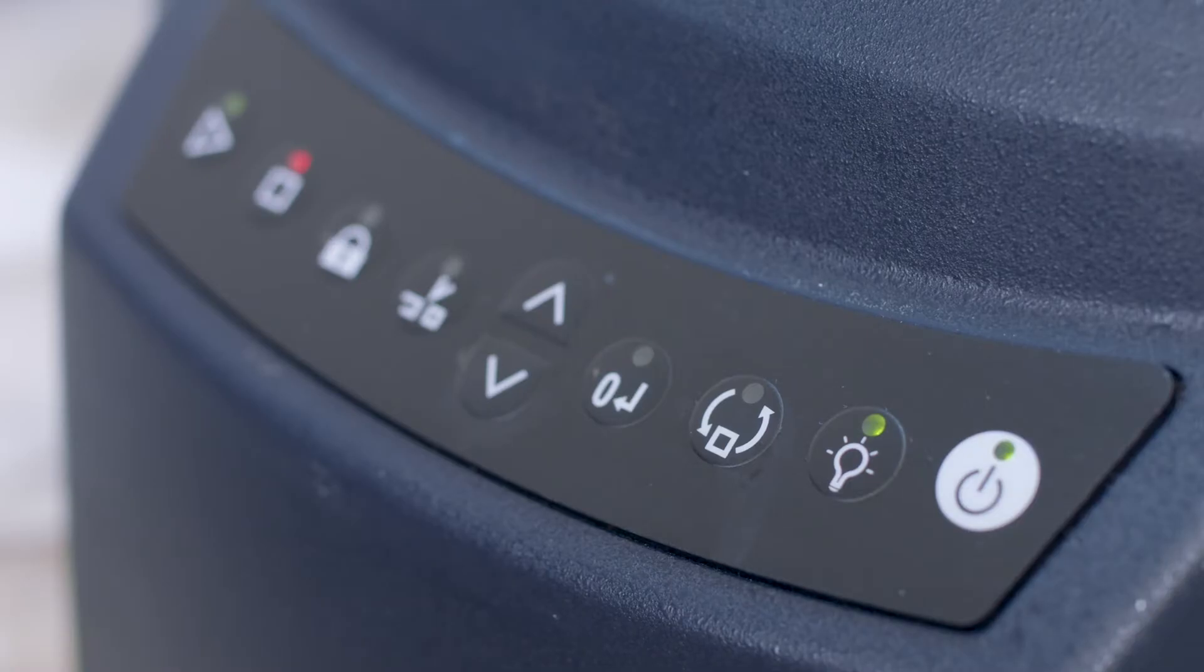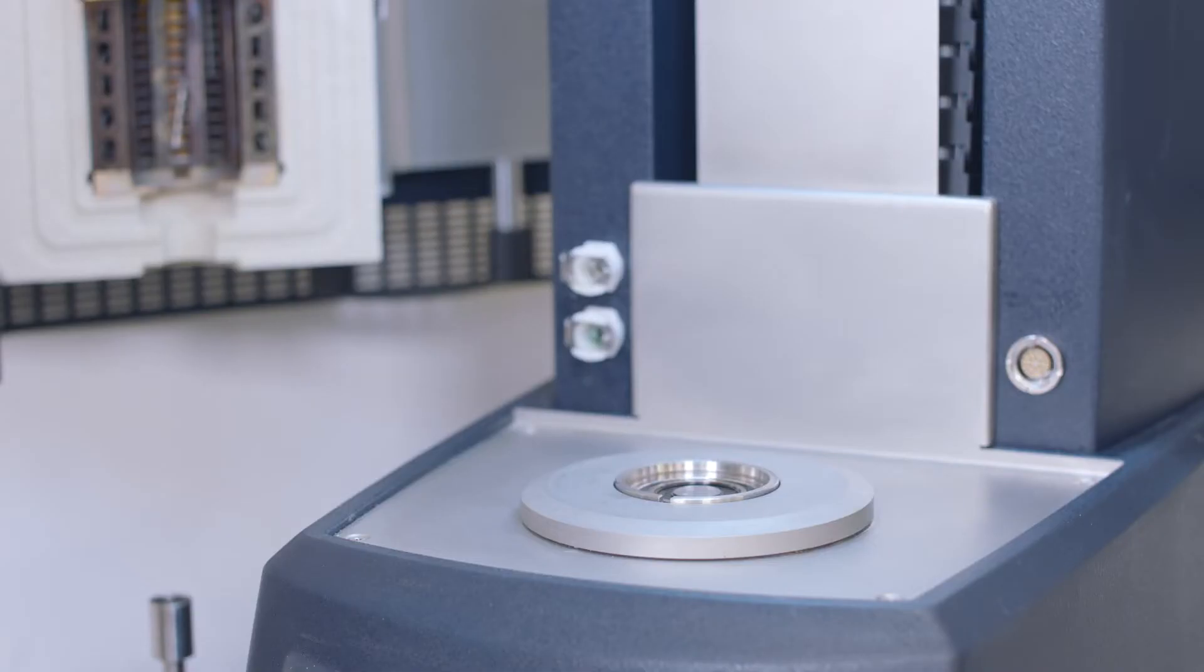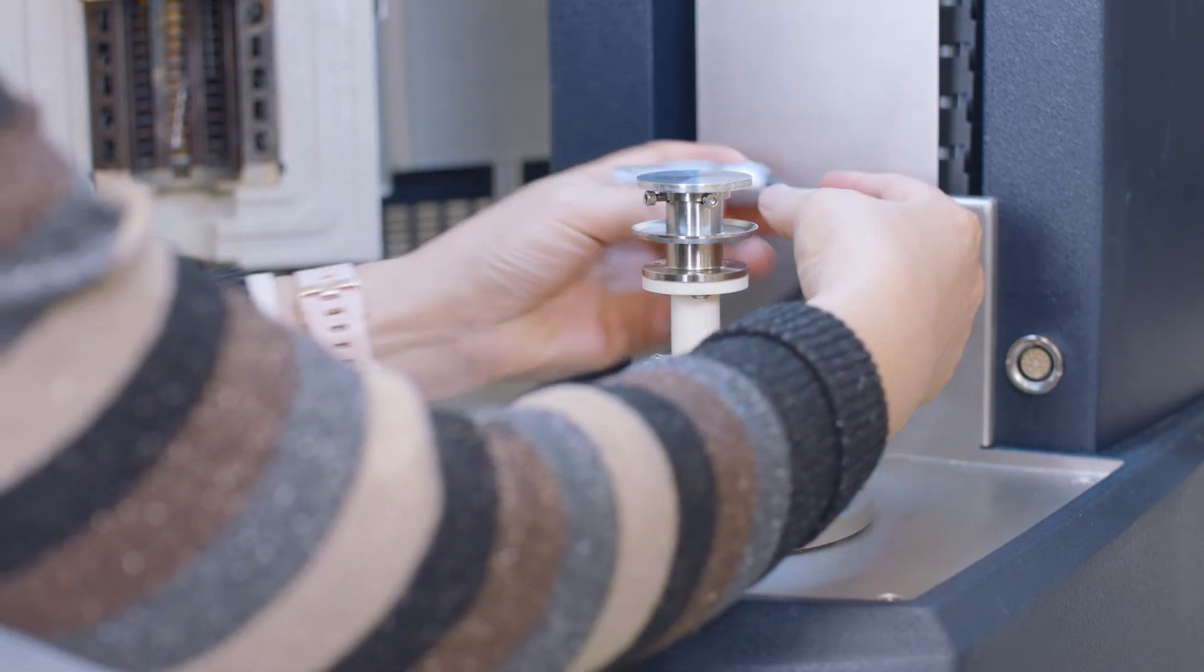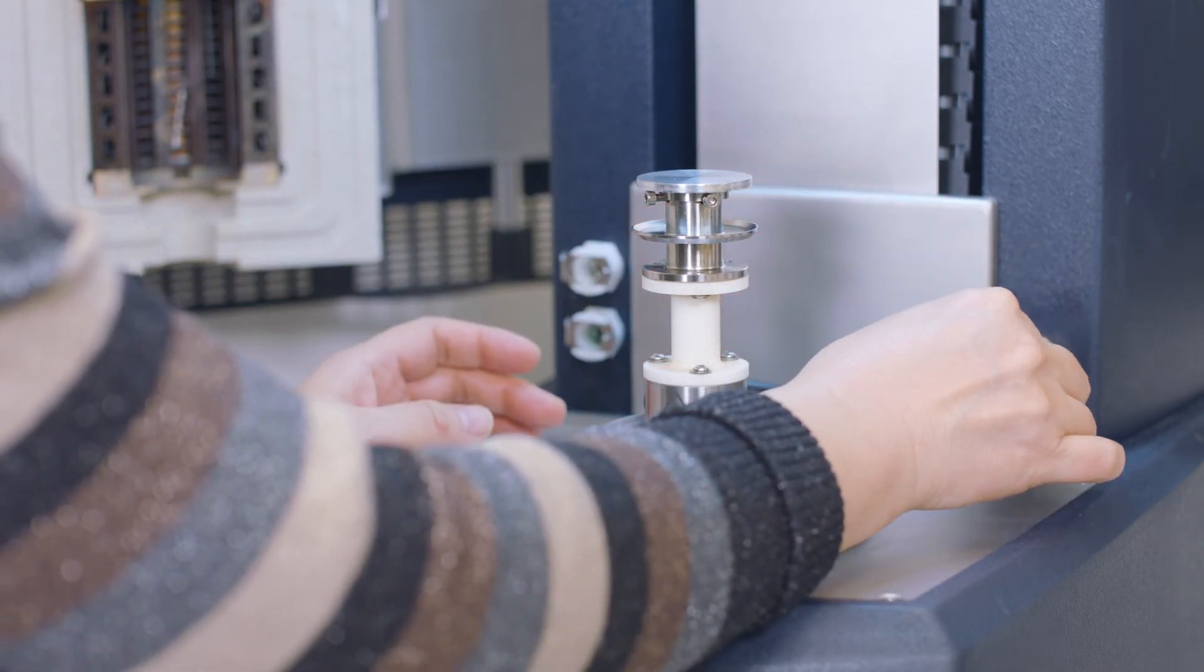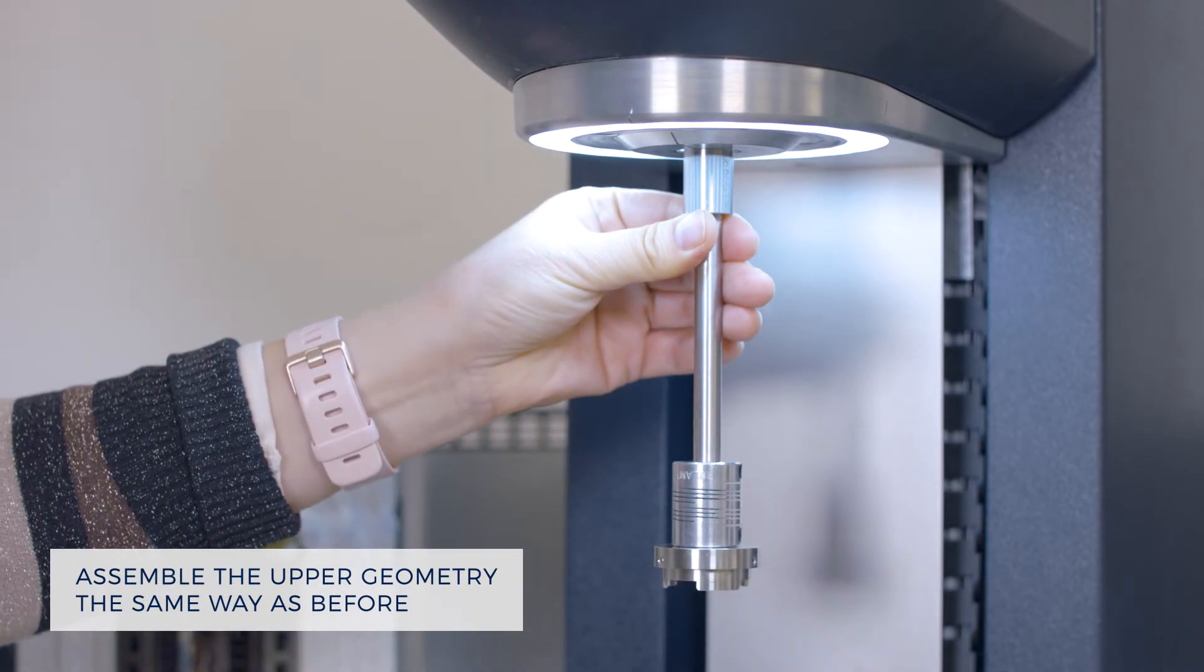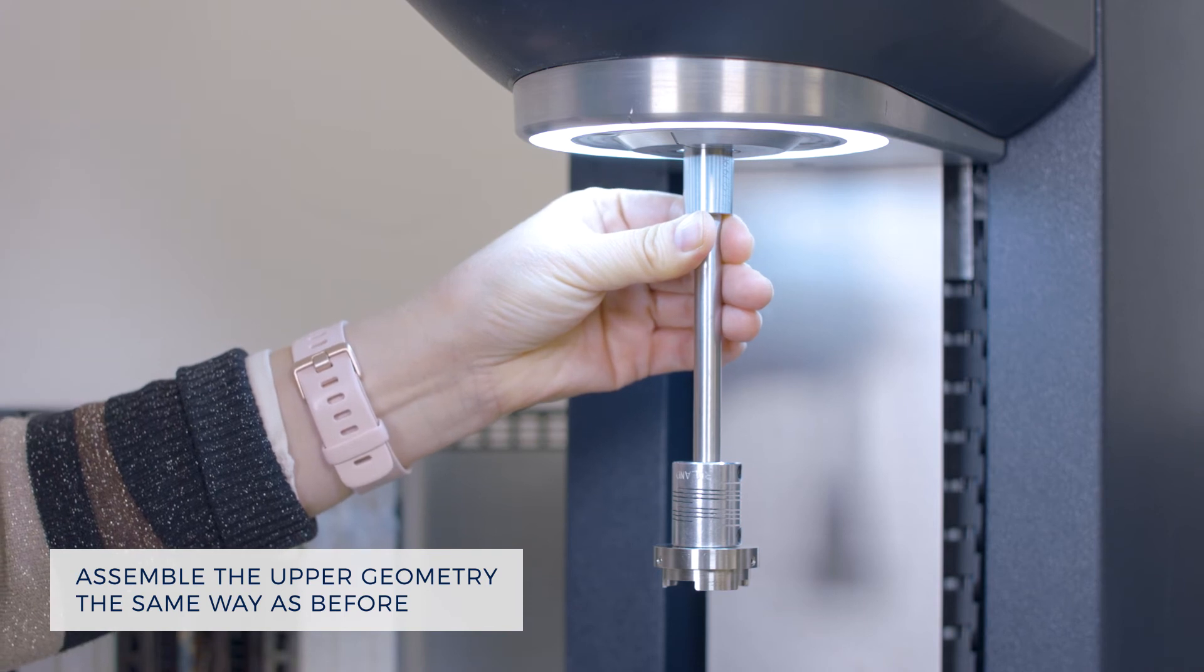From the instrument control panel, press this button to temporarily release the magnet. Put this ETC bottom geometry onto the instrument bottom stage. Then insert the SmartSwap plug with the red dot facing up. After that, install the upper geometry to the rheometer.